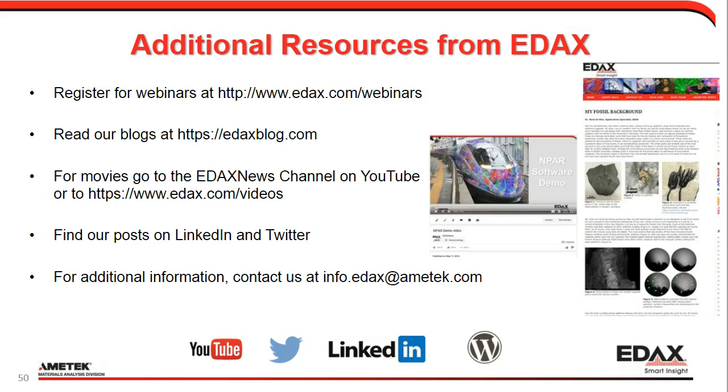So right now we are still using TEAM, but eventually Apex will take over. You can upgrade from TEAM to Apex, and just be aware that a lot of the TEAM upgrades would require a PC upgrade as well. So please go through our service department for a configuration check if you are interested in this upgrade.